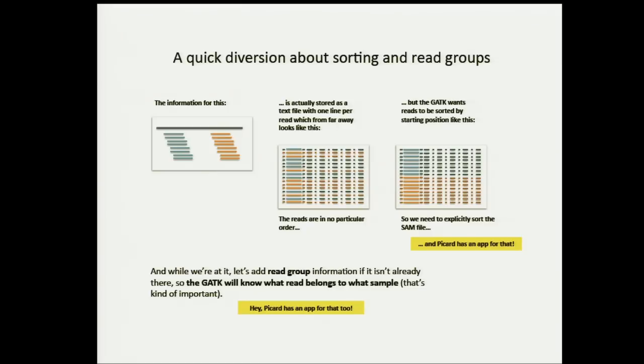And then after this, we have the most important step on this tool, which is adding the read groups. Like Eric said, read groups are key for the GATK to process the information correctly. If it doesn't have a read group, it will barf on you. It will not process your file at all. And no aligner adds the read group by default. You have to add the read groups after the alignment process.